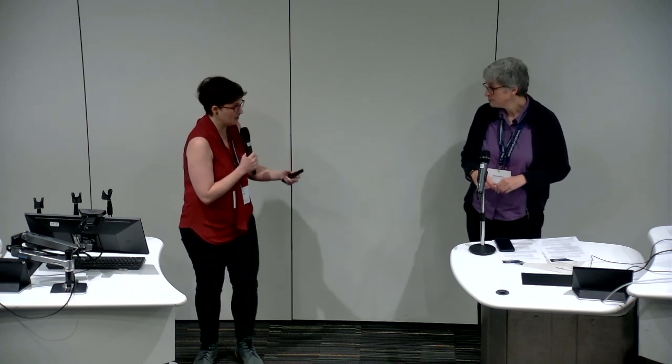Absolutely. So there's things robots are particularly bad at, like picking up paper or picking up fabric. So picking up a piece of filter paper is a huge challenge. So we can work ways around this. The robot can do some of the manipulations, and we could couple it with image analysis to see whether or not it was successful at, like, if we knocked the vial gently against something, did it knock the powder back into the vial as we were expecting?